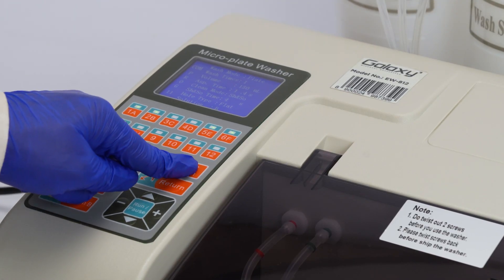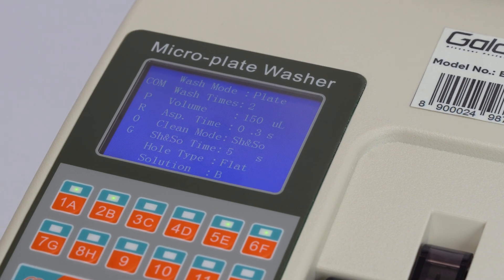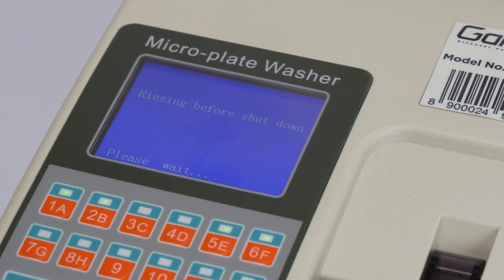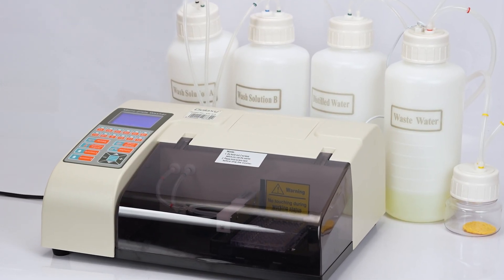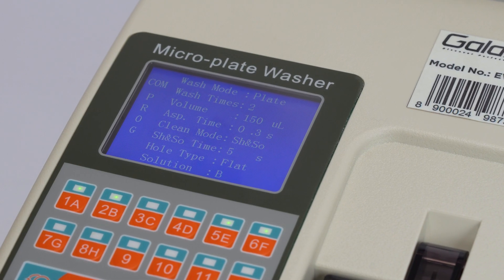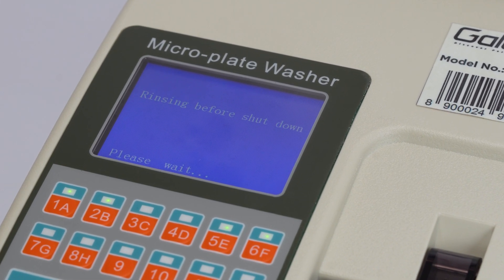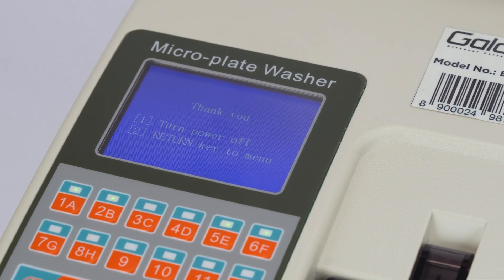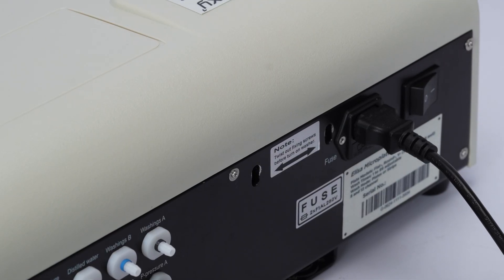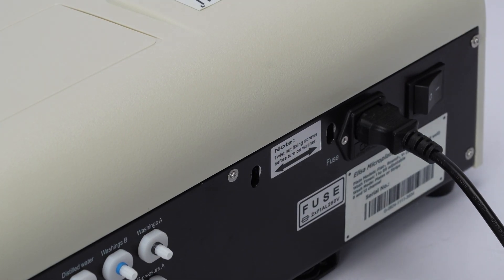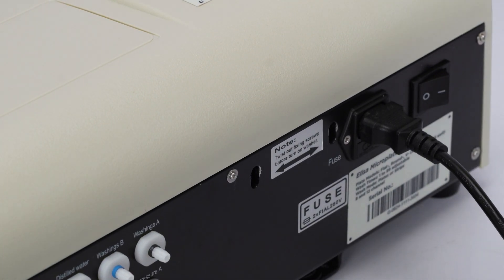Press the shutdown key to begin the shutdown procedure. The machine will rinse the tubing with distilled water. Once finished, a reminder will display: please turn power off. Then switch off the washer using the power switch on the left rear of the instrument.